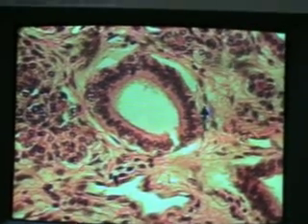All right, this is probably another. You can see these all over the place when you look at them. And then as you get a pseudo-stratified duct system, now you're intralobular, and then it goes interlobular, and then the lobar duct, and so on. So that would be what we would see essentially in the submandibular gland.